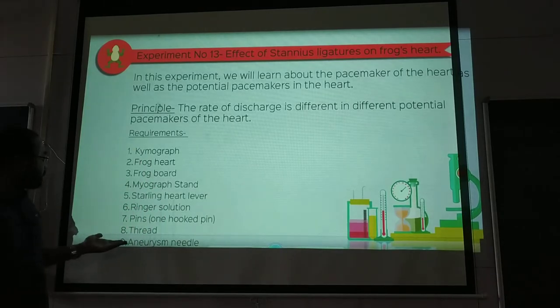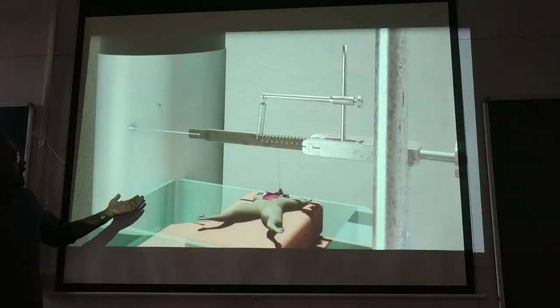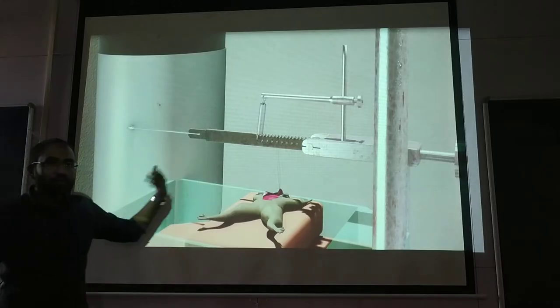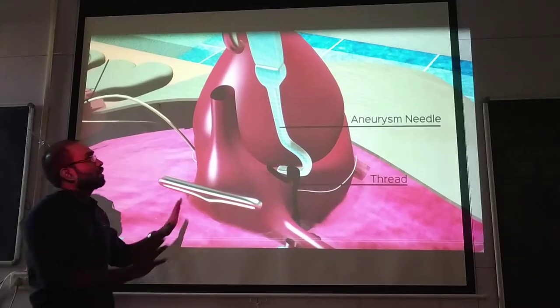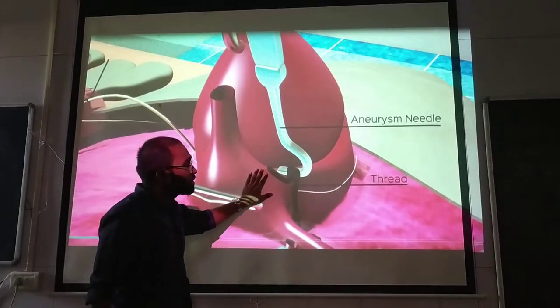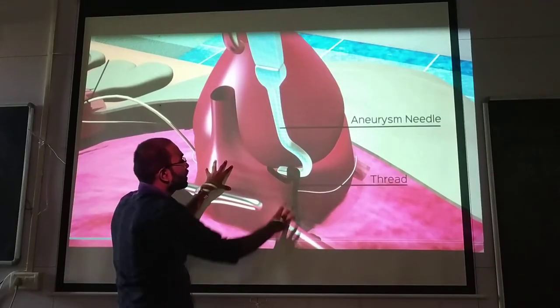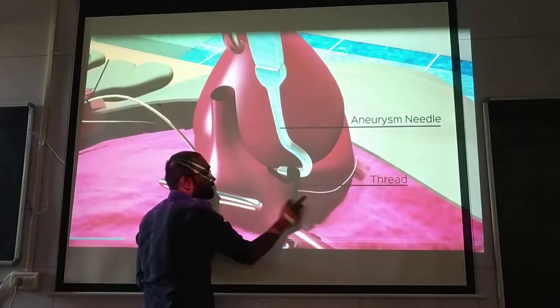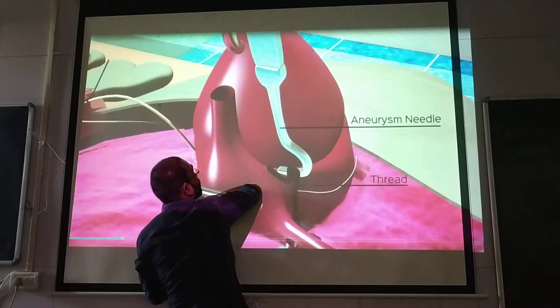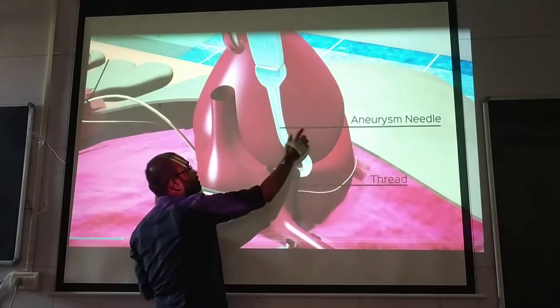First we have to take a normal recording. Now, on the frog's anatomy — which we have studied earlier — sinus venosus is here, atria is here, and ventricle is here. So the frog's heart consists of sinus venosus, atria, and ventricle in that order.